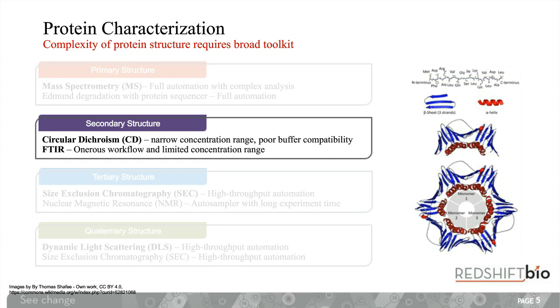Being based on absorption of light in the hundreds of nanometers range, this means that we have quite large effects from scattering, particularly from things like excipients in the background, surfactants, and also from aggregates formed by the sample itself. So this means that circular dichroism spectroscopy is a very useful technique, but it has quite a lot of constraints on it.